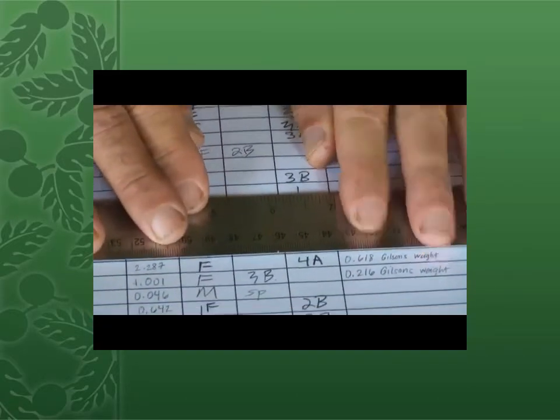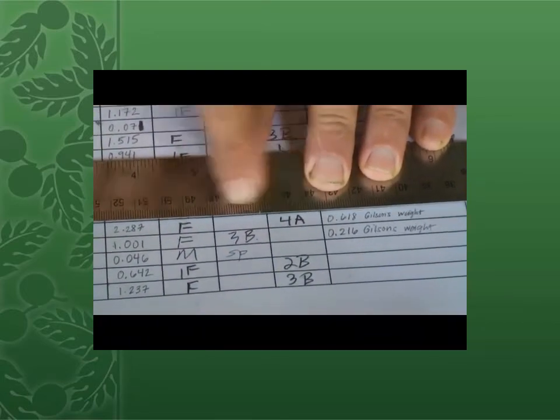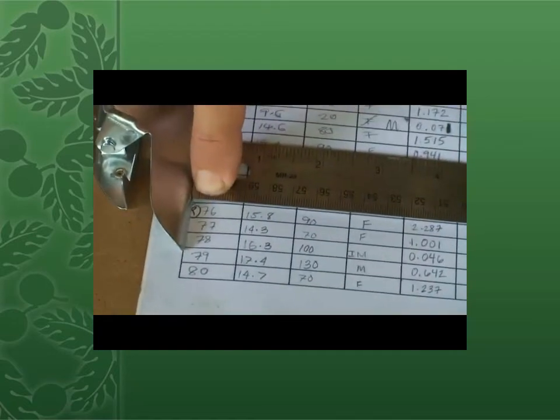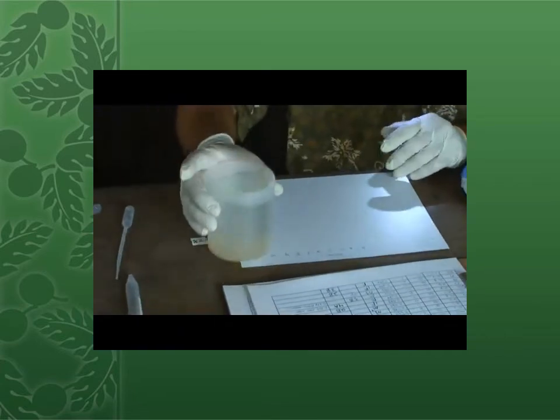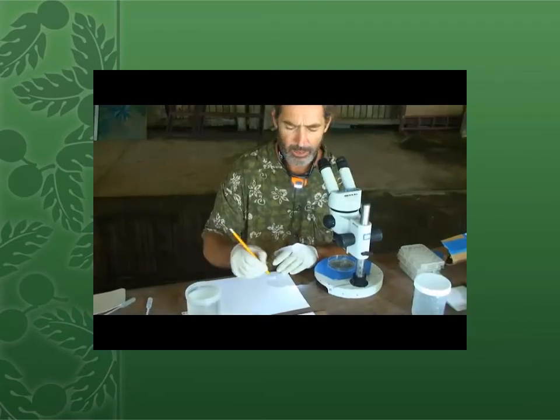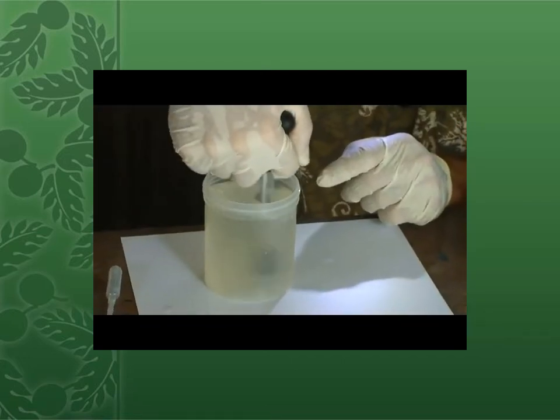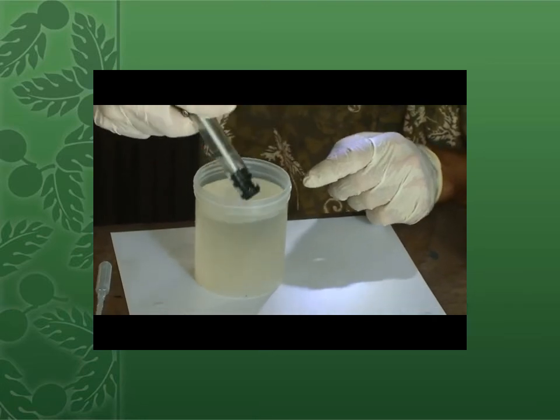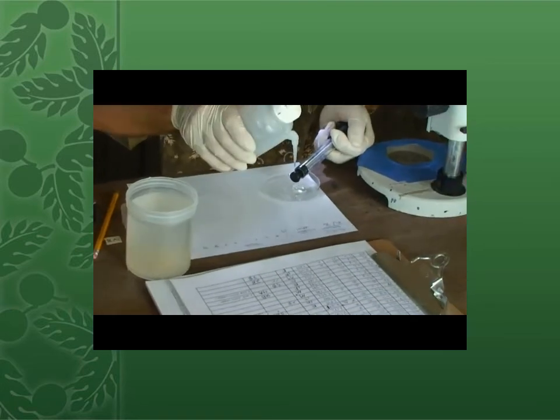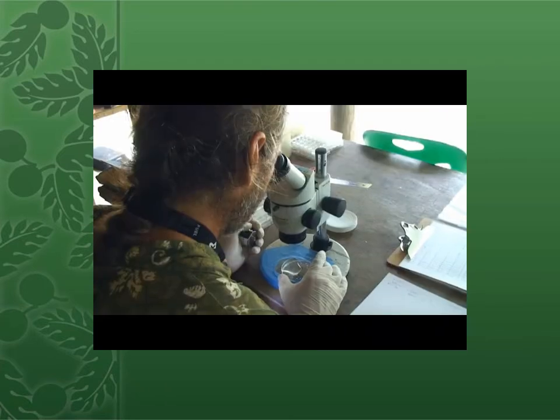To choose which of those samples to analyze, you'll go to your data sheets and choose the specimens that have reached spawning stage, as determined by histological examination. You'll dilute those samples to a constant volume, record that dilution volume, stir up those diluted eggs, and use this special pipette called a Stempel pipette to remove exactly 1 milliliter of those diluted eggs.